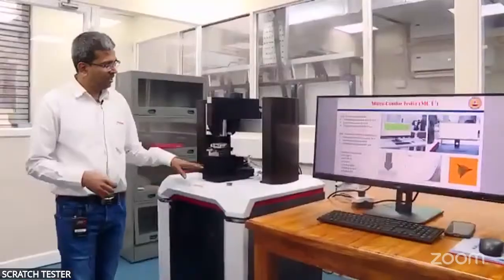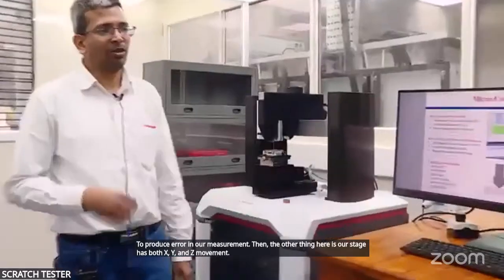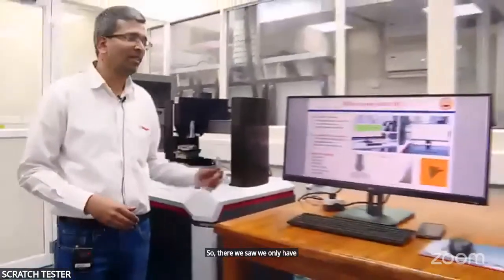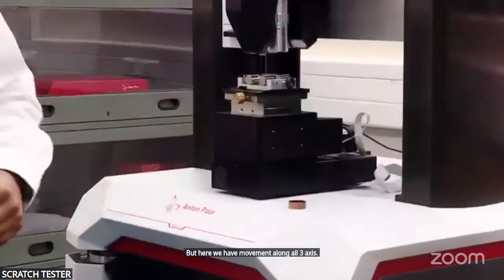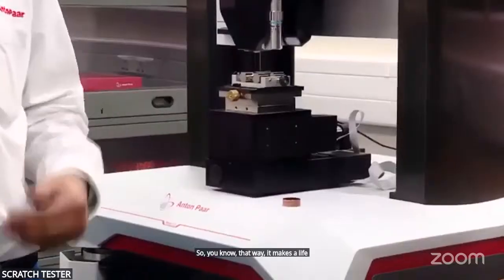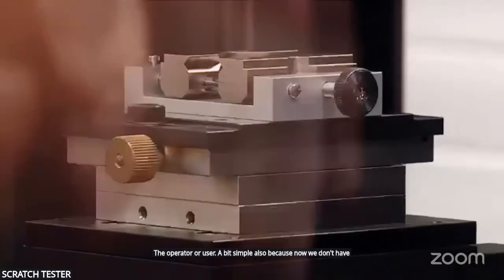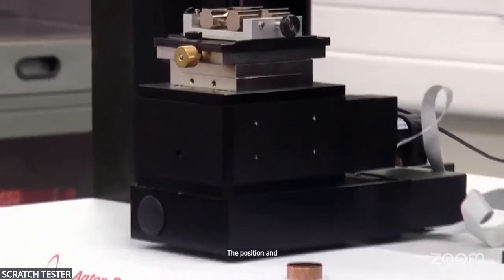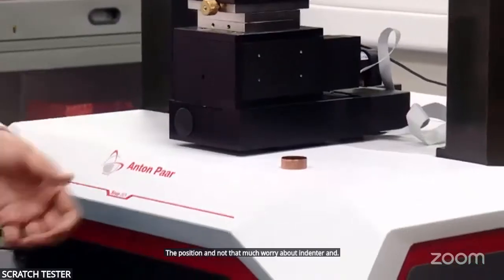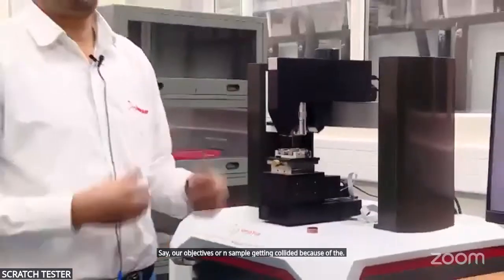Then the other thing here is our stage has X, Y and Z movement. There we saw we only have movement along one axis, but here we have movement along all three axes. In that way it makes the life of the operator or user a bit simpler, because now we don't have to unscrew the knuckle, move it up and down, and see the position, and not worry that much about the indenter and our objectives or the sample getting collided, because of the automatic movement itself.